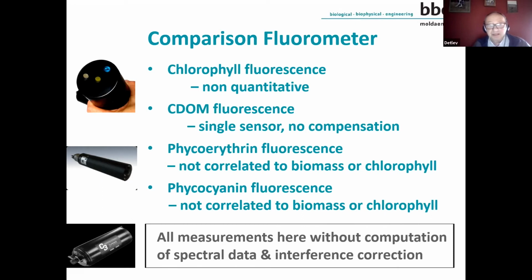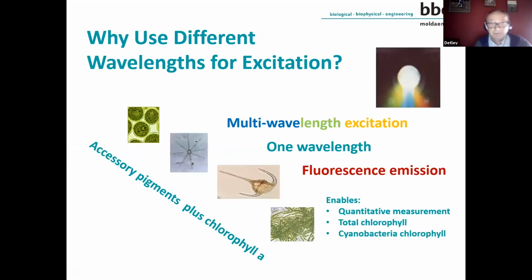In contrast to our instrument, where we have the spectral data of algae integrated, but I will show you this in the next slide. And I also have to indicate that we also try to reduce the effects of interference by other effects like turbidity or other compounds which might disturb the measurements.